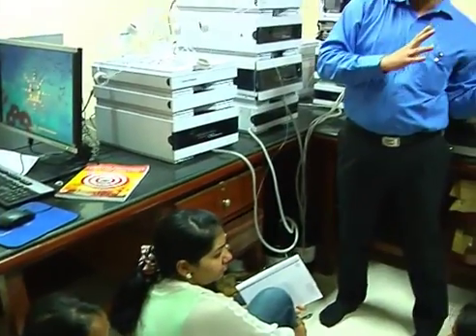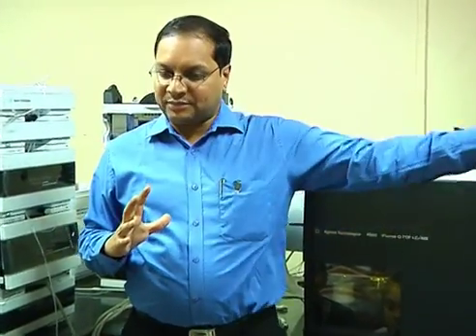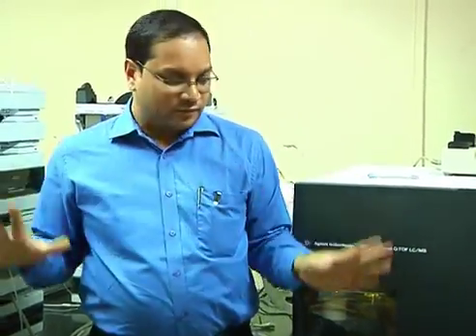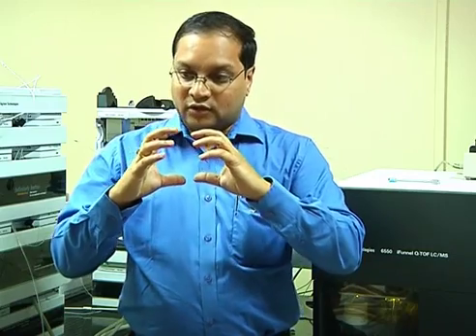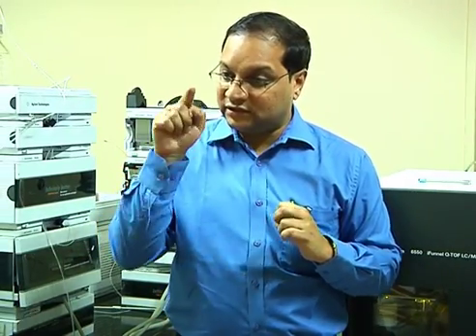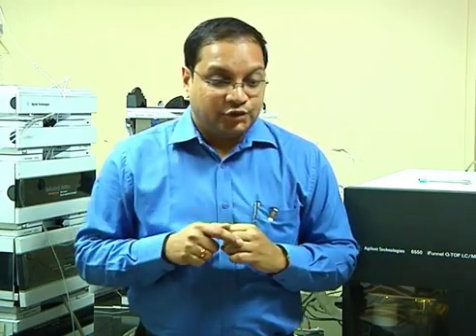Let us understand in general first the functionality of why we use this and then applicability. And these are very specific questions because you have experience, that's why you are asking. Some experience I could sense that, but most of you may not have experience. But at least you should know what exactly quadrupole is doing. So quadrupole is a filter. Okay, it's a mass filter. It's very specific because of that. It is selective, hence sensitive. That's why it is used for targeted analysis.